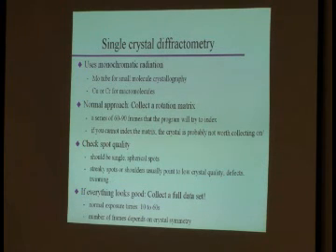Single crystal experiments use monochromatic radiation. Most instruments for small molecule crystallography will use molybdenum. For macromolecules, you usually find either copper or chromium. Nowadays, copper is more common. The reason for that is you have much bigger unit cells, so you get many more reflections, and you want to be able to resolve them, okay? Yes, you want to measure enough reflections, but if they start sitting on top of each other, you really don't win.